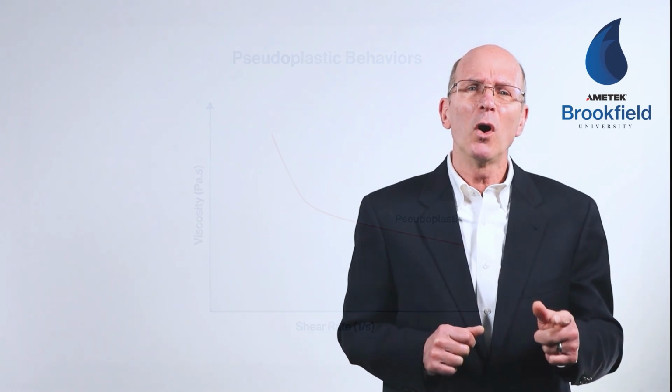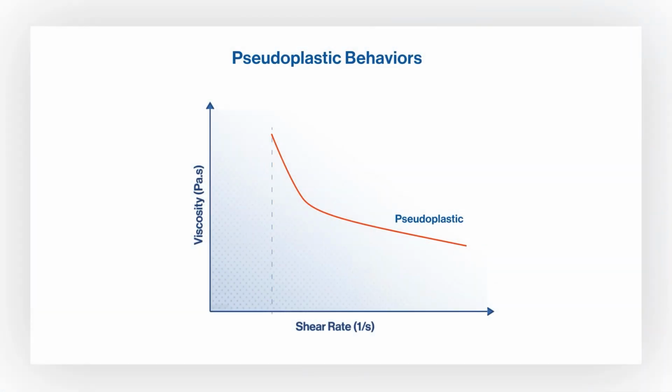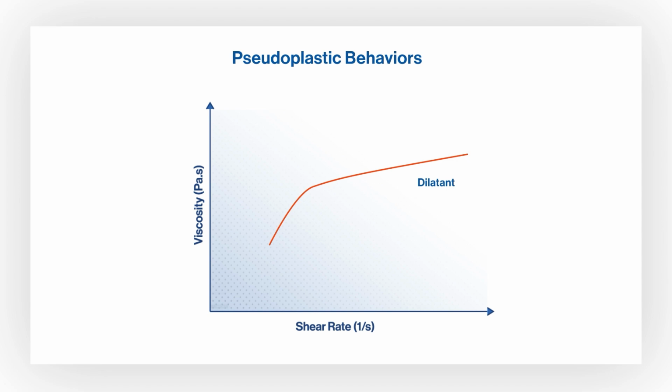You can see that when the material begins to flow, it is already at a higher shear rate than zero. As you can see on the graph, the fluid will not begin to flow until the applied shear stress exceeds the static yield value of the fluid. Once the value is exceeded and the flow begins, plastic fluids may display Newtonian, pseudoplastic, or dilatant flow characteristics.